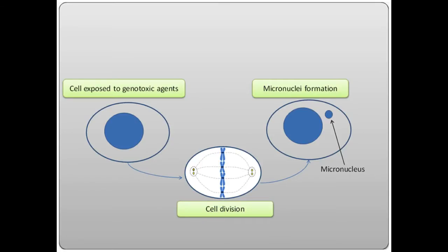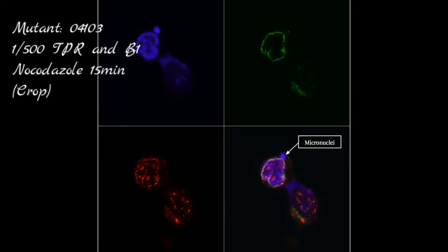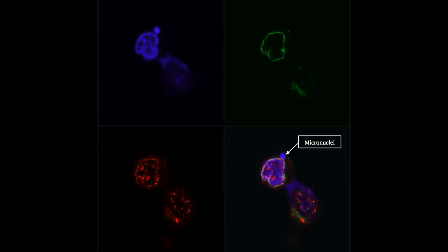The second portion of my project is to visualize micronuclei within premature aging cell lines. Micronuclei are chromosomal aberrations that are ejected from the nucleus due to a dysfunction during cell division. Micronuclei form their own separate nuclear membrane, which tends to break down due to its lack of stability. We are able to visualize these fragmentations through immunofluorescence, during which we tag various proteins with antibodies such as RAN, MAB414, lamin B1, TPR, and pericentrin.